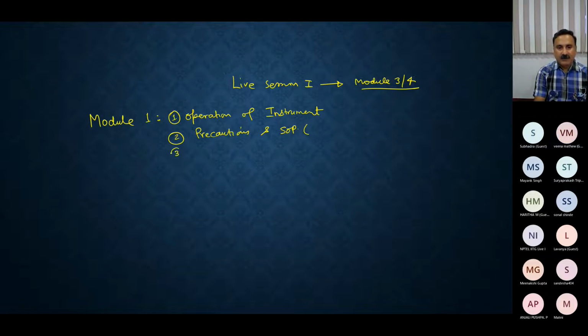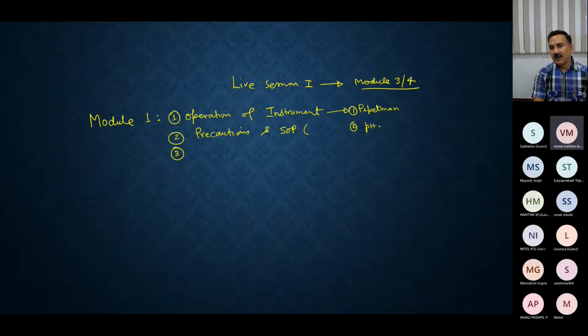And then we discussed the basic principle as well as the operation of some of the instruments. We discussed the pipette man, the pH meter, and the water distillation unit.